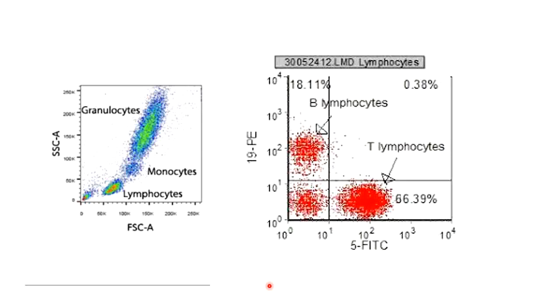Okay. So if my flow cytometer is containing 1 laser, then generally we can detect 2 colors. 2 fluorescent colors means we can detect 2 types of proteins. Then you can have 2 lasers, which means 8 colors. 8 colors means you can measure 8 fluorescent dyes or 8 types of proteins simultaneously, or 8 types of fluorescent signals simultaneously. Then you can increase the number of lasers, 3rd laser, then 14, then 18. So that depends upon you, right, what you can do.